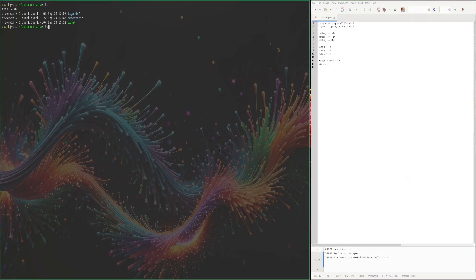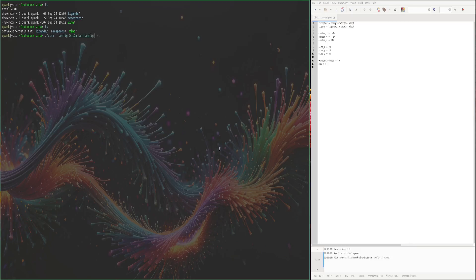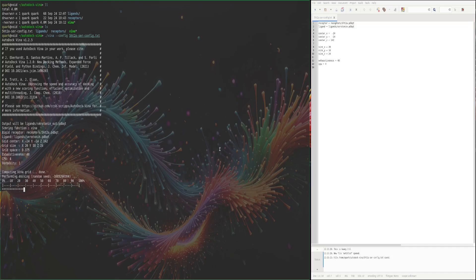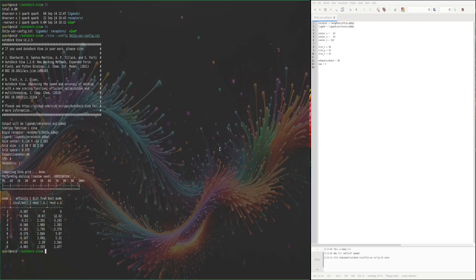If we look in the folder we can now see our configuration file. We run Vina from the command line using ./vina --config 5ht2a-ser-config.txt, and Vina will read all of the configuration settings from the text file. We can see it's running and we get very similar results as before — a binding affinity of -6.6 kcal/mol, confirming that serotonin is a good binder for the 5-HT2A receptor.